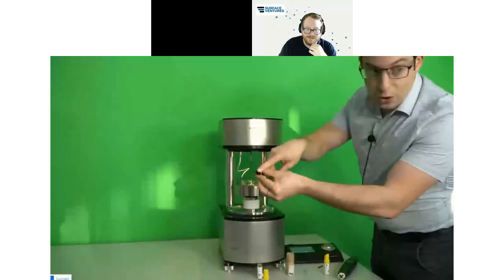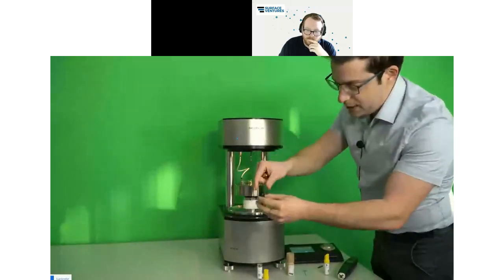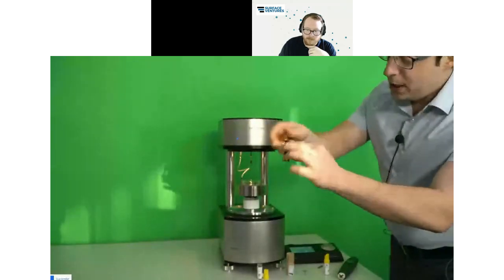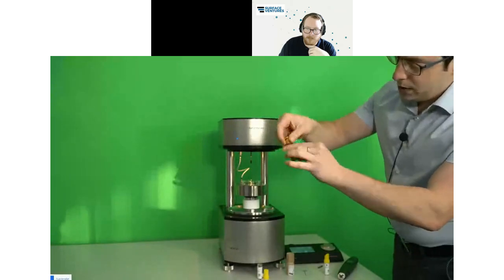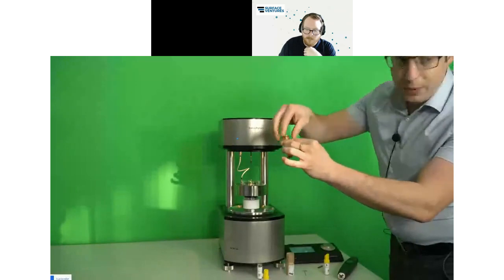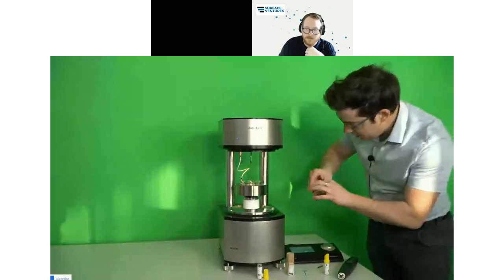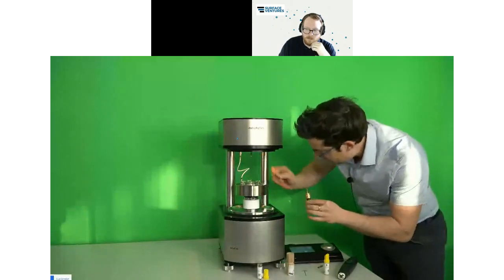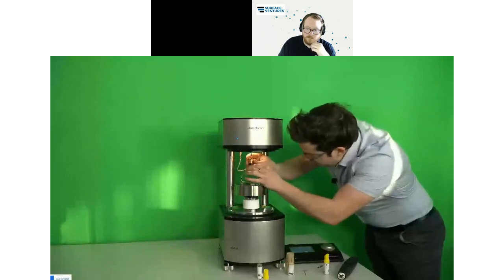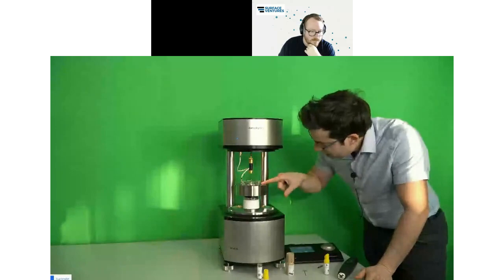This one is hollow inside, and then you just take my shirt or any other fabric and you stuff it in here. And then you can see there are many, many tiny holes below. Then you close your pipe, and with the little wheel here on top, you can very precisely compress it inside. Then you take the whole thing, you remove your single fiber, and you put in this one here. Good.